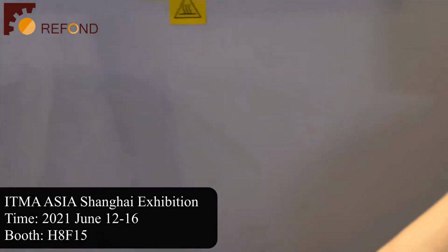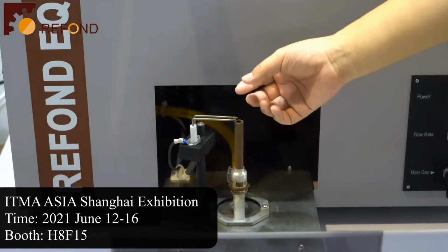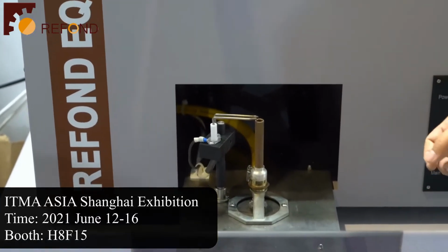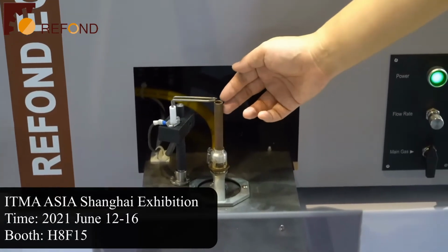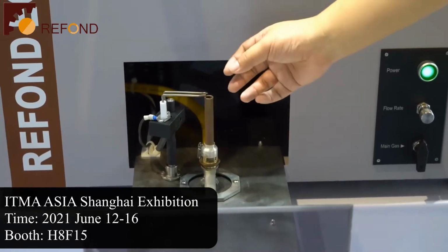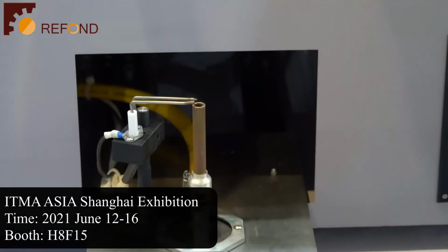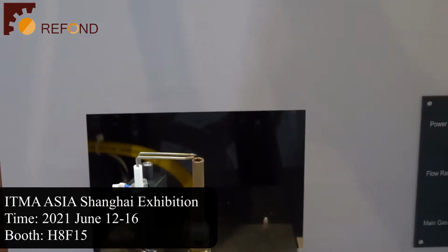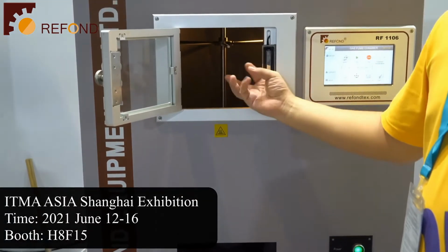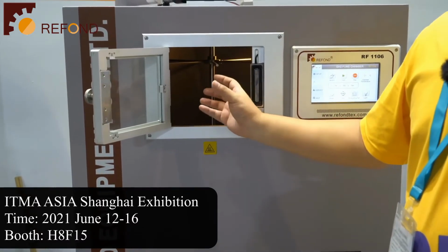A blue flame has a higher temperature than a yellow flame, and the higher temperature of the flame is what's generating the nitrogen oxides. The main components involved are nitrogen monoxide and nitrogen dioxide. These two chemicals will be created near the flame, and then follow the hot air up into the test chamber. Here, the sample rack will rotate slowly to make sure all the specimens are exposed to the nitrogen oxides evenly. The nitrogen oxide will cause the sample to change color.